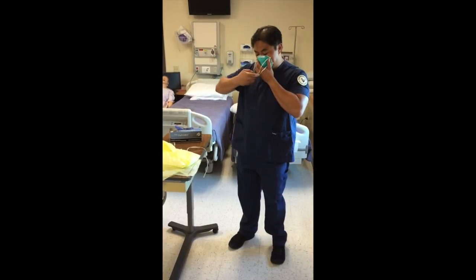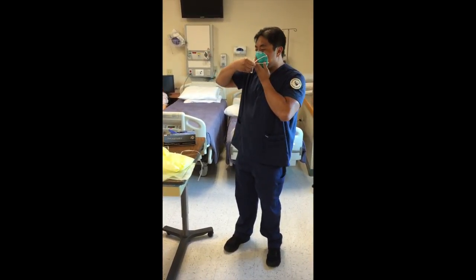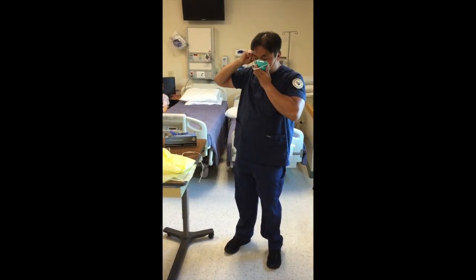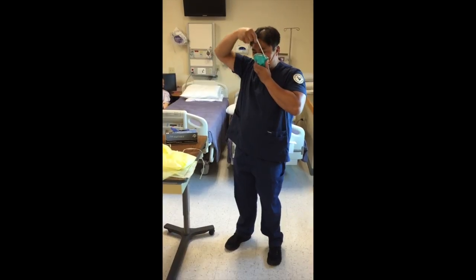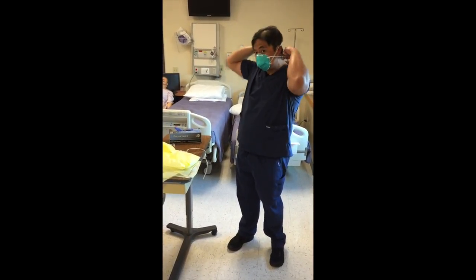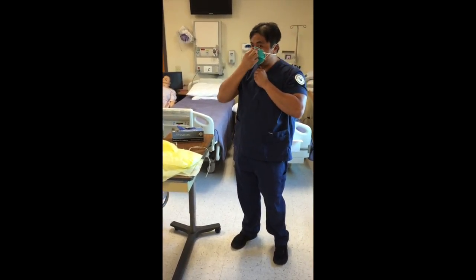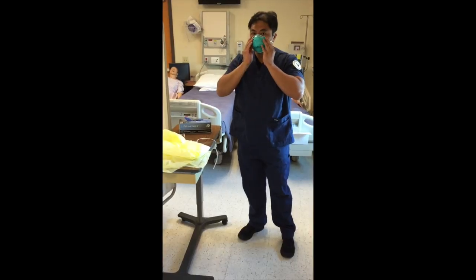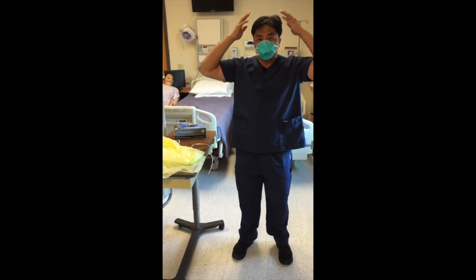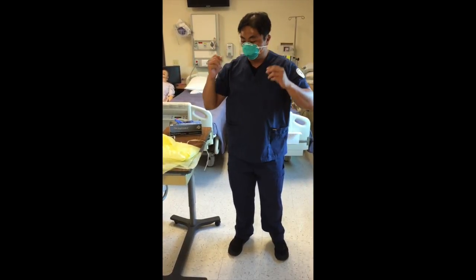So you want to start with the bottom one. Then put the top one. It looks like we have a little crisscross right here. Cinch this part right here to make sure that it's tight. Then you would put on your cap as well as protective eyewear.